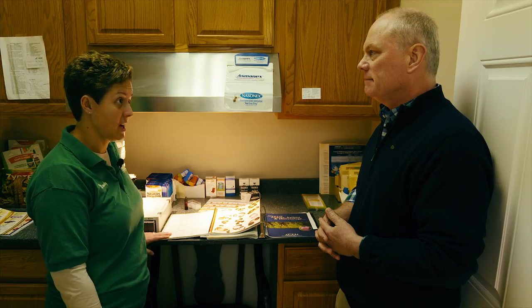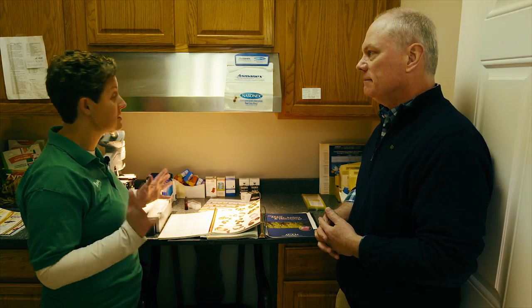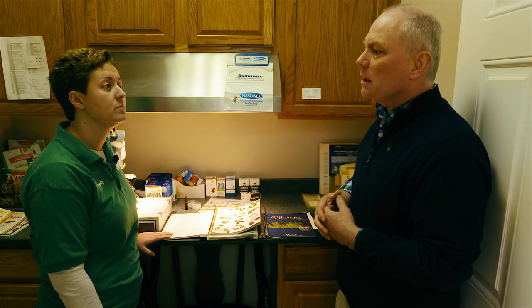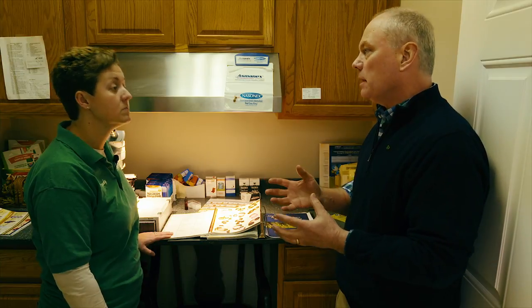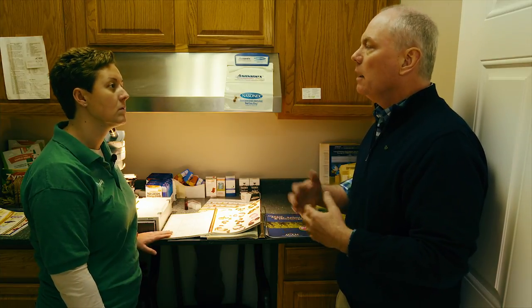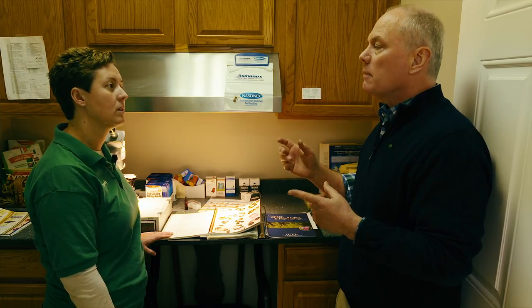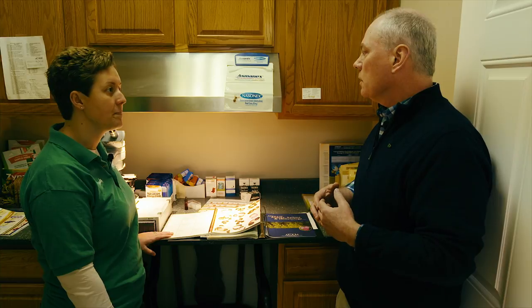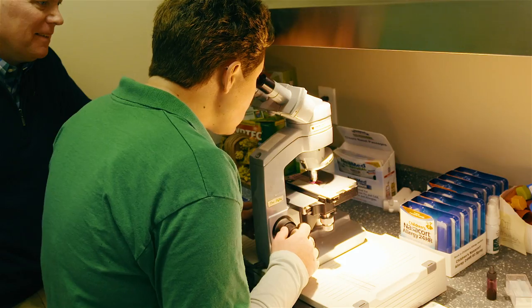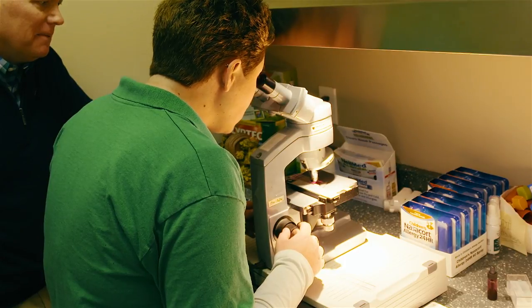So Dr. Gales, we are here in the lab. What exactly happens here under the microscope? So one of the things we do is, in my other office, I sample pollen in the area. When you come in saying you're itchy, you're sneezing, I can get an idea of what pollen is in the air. We get the sample and then we put it under the microscope. Then we identify the types of pollen from the trees that are emitting, or grasses or weeds. I set a little pollen grain up there. Why don't you have a look in the microscope? Dr. Gales, what exactly am I looking at?